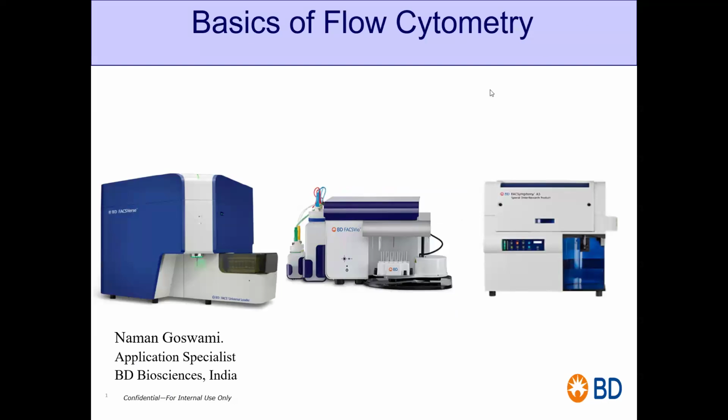So good morning, everyone. I am Naman Goswami. I'm from BD Bioscience and I'm an application specialist here. So today we'll be talking about the basics of flow cytometer. What does flow cytometer mean? What can it do? What applications do we have? And a lot of things we're going to discuss in this session.